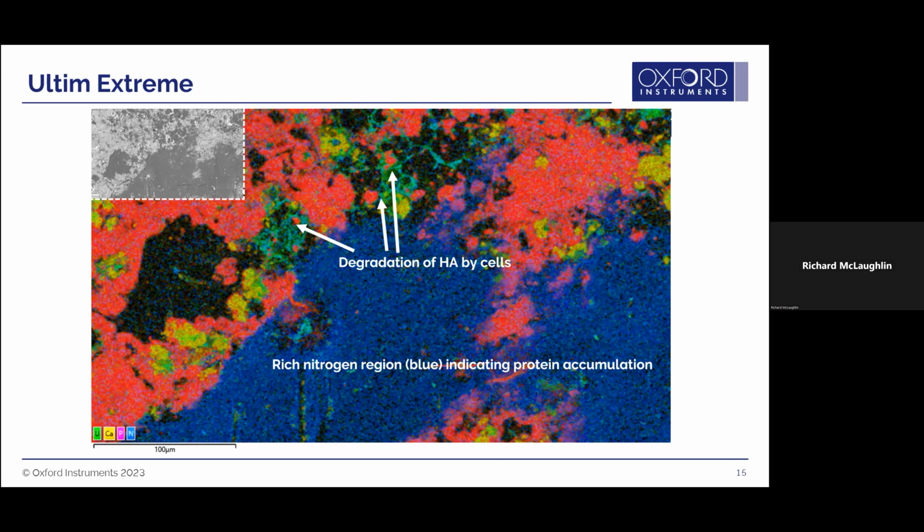It's not producing new bone, but it's new cell growth. But the cells that are producing this new bone growth are stained by uranium, and they appear as a bright green region. And the actual apatite is shown with phosphorus, high enrichment with phosphorus. And then you also see in the apatite sample, there's yellow areas, which indicate that for some reason, phosphorus is depleted in that hydroxyapatite region, and calcium is enriched.